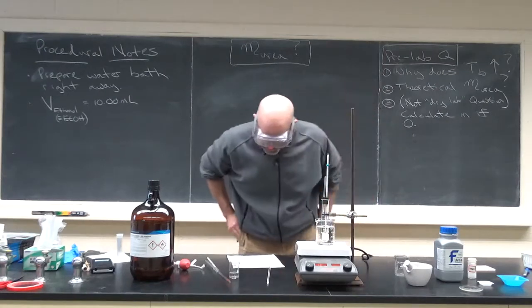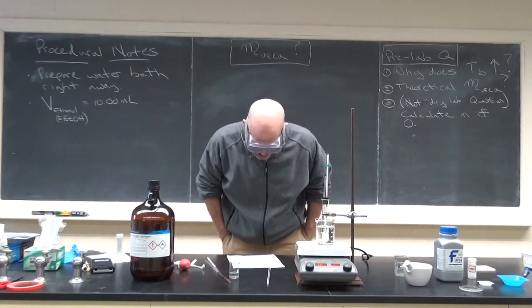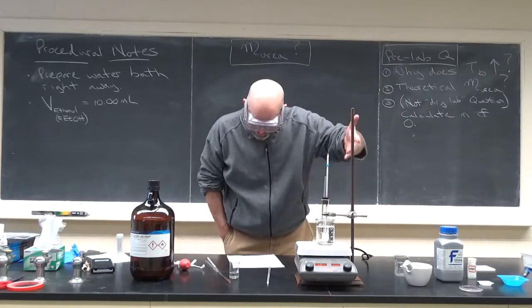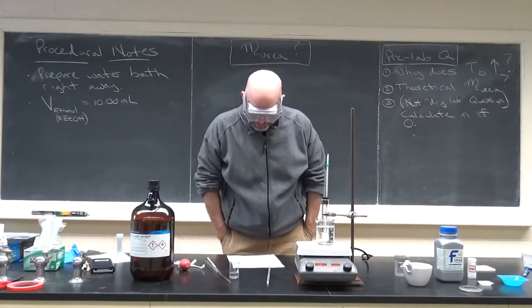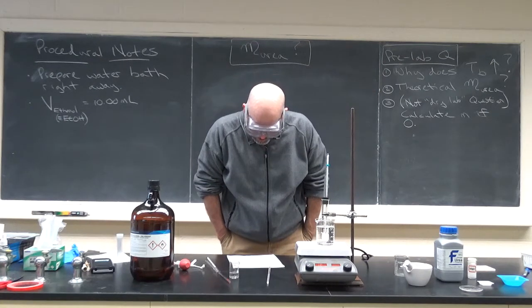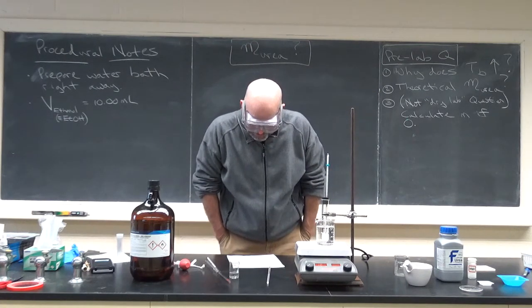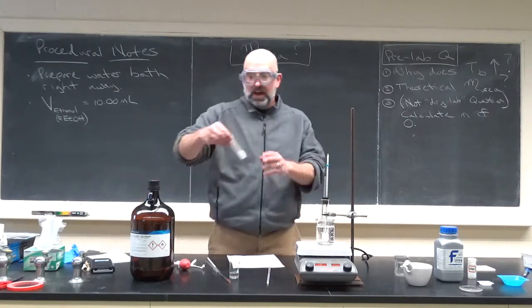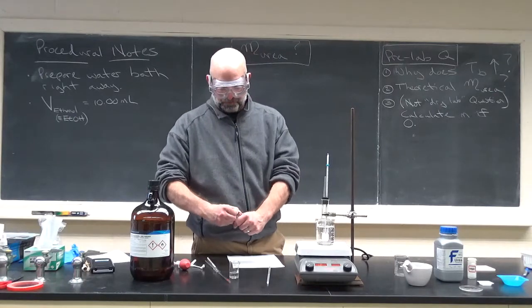It's not touching anything. What does it say? Check that the bulb extends below. Use a ring stand and clamp it. Okay. Carefully. Oh, I forgot to do the capillary tube, didn't I? I'm going back in the procedure. Obtain a melting point capillary tube and drop the open end down into the ethanol. All right, these are capillary tubes.